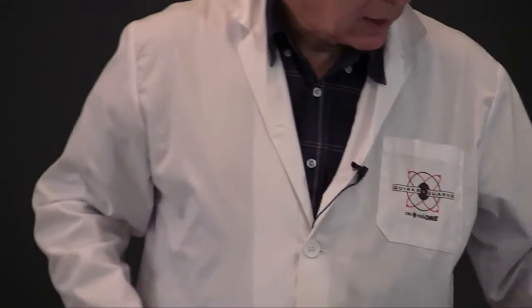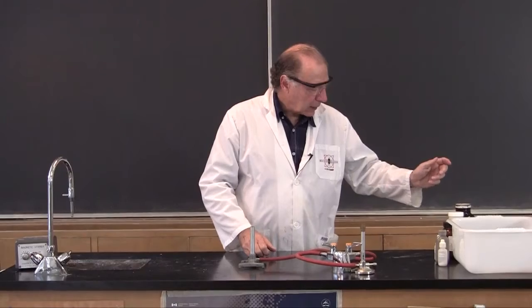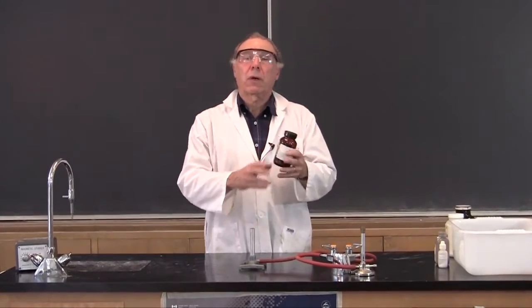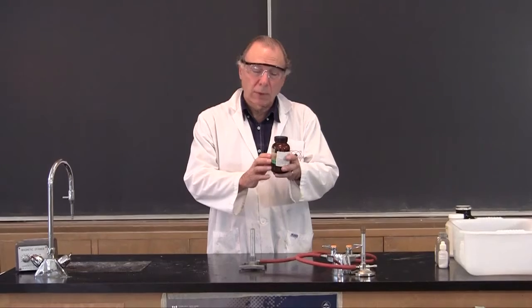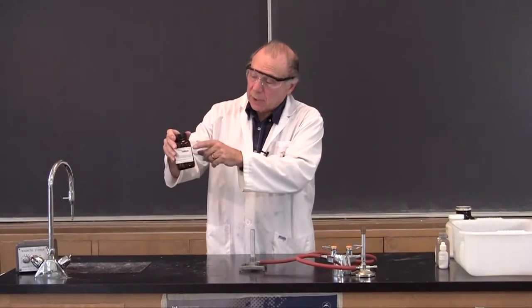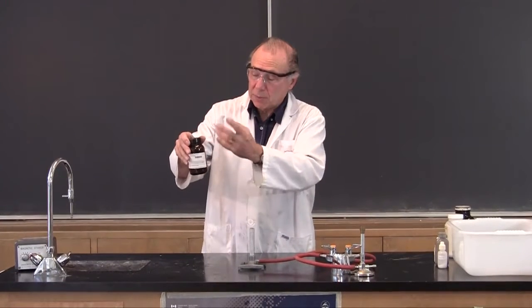I will take your bottle. We'll take copper first to illustrate the emerald green color of copper. So I'm using here a bottle of copper oxide, CuO, black powder, and I'm going to shake it up so that in the space here the copper oxide particles will be dispersed.